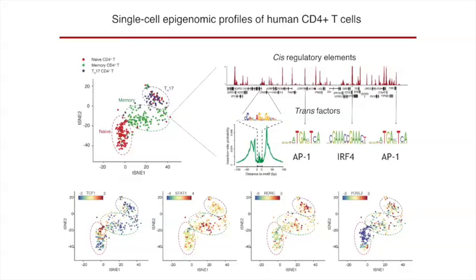You can imagine this as if you're spray painting a wall and you put your hand in front of the spray paint. When you're done, there's an imprint of your hand, right? In the same way, if a transcription factor is sitting on top of the DNA and you're transposing that DNA, when you're done, there'll be a little imprint of where that transcription factor was sitting. And so in that way, you can infer, with some confidence, not 100% confidence, what that transcription factor was that's sitting in that peak.